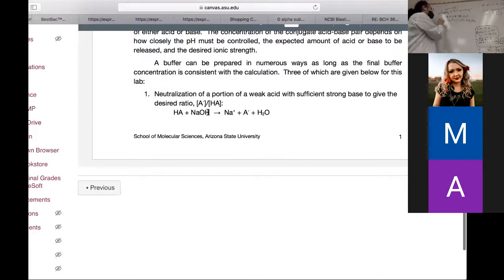So same thing here. For this, you calculate how much of this you need similarly to this one. You use 0.1 molar times 50 ml, and then you get n. By doing this, you get n over here, and you use n times the molecular weight of this one, and it will give you the mass.